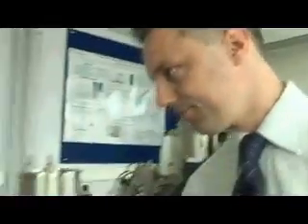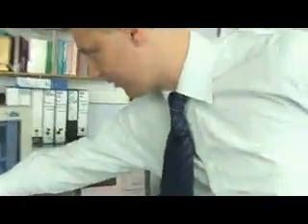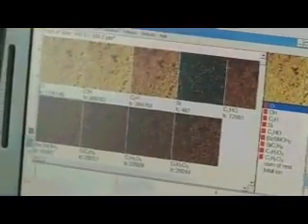But what this does then eventually is it gives us a spectrum. And you can see a spectrum that's coming out here. And basically each little peak corresponds to a particular type of material on the surface. And we can take that information and then map that on a surface and say what material is where. And that's critical in understanding how, for example, coatings of implants interact with our body.